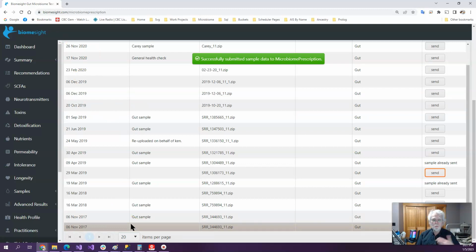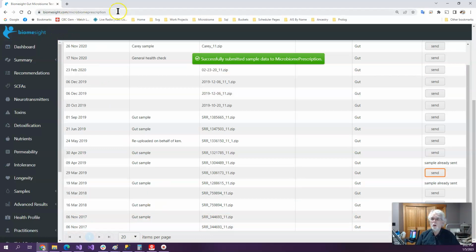We are not using login passwords. We are using email, and we send a link to your email to authorize the login. And that way we have close to two-factor authentication, but without the hassles of having to have a phone handy, etc. The authentication goes to your email. You can keep reusing it, or you can request a new one whenever you want to and get a new key, and the old key will be disabled. So you could share your data with somebody for a length of time and then stop sharing by simply asking for a new key.